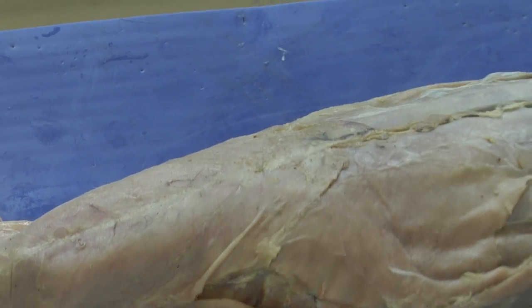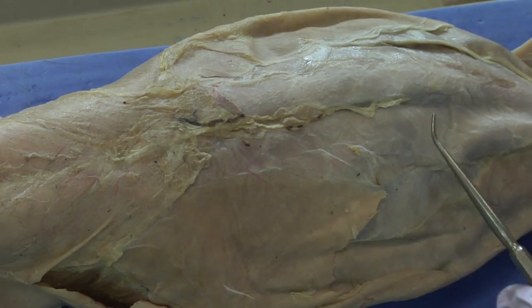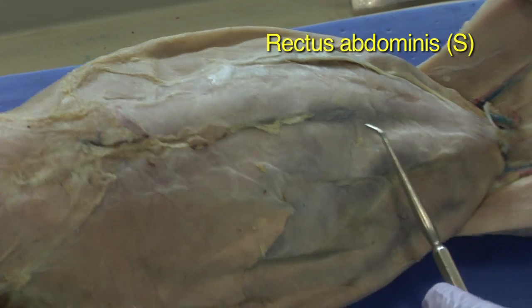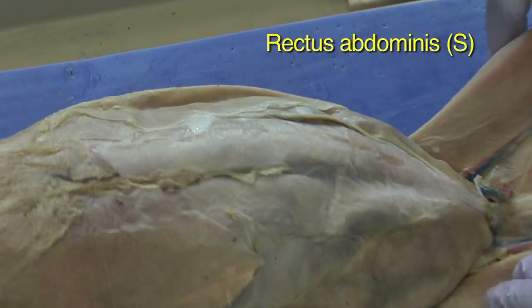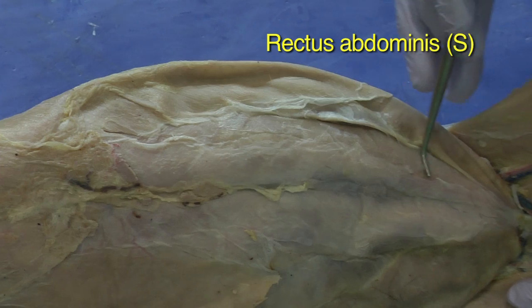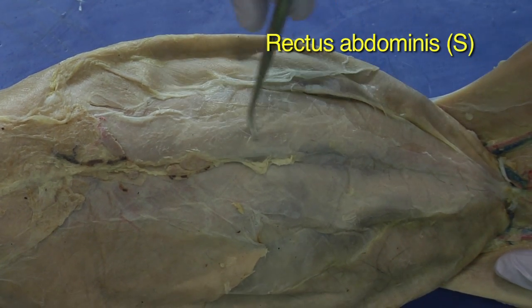And then if we move along the stomach, you have the rectus abdominal muscles, which are straight muscles that run up pretty much the full length of the abdomen.